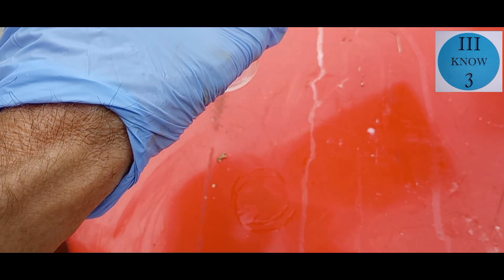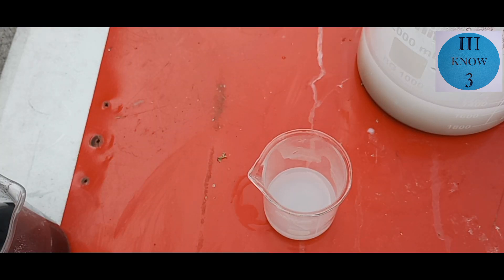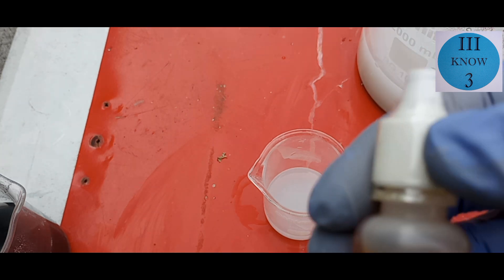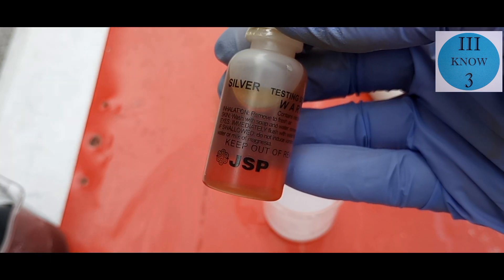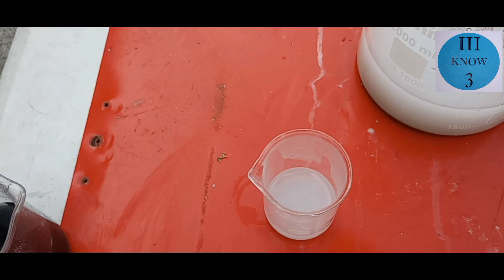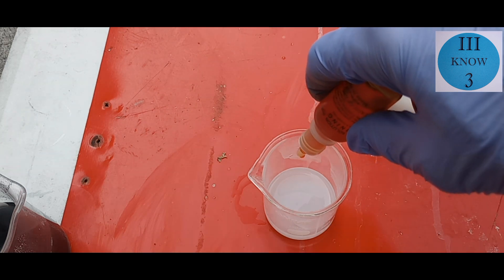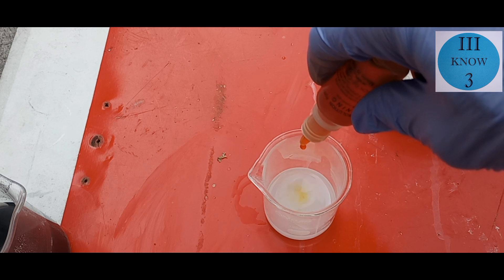So I'm going to get a little bit of this solution, and then I will add some of this silver test. Potassium dichromate should make the solution turn yellow if there are lead salts or lead dissolved in the liquid. Four or five drops should really be plenty.